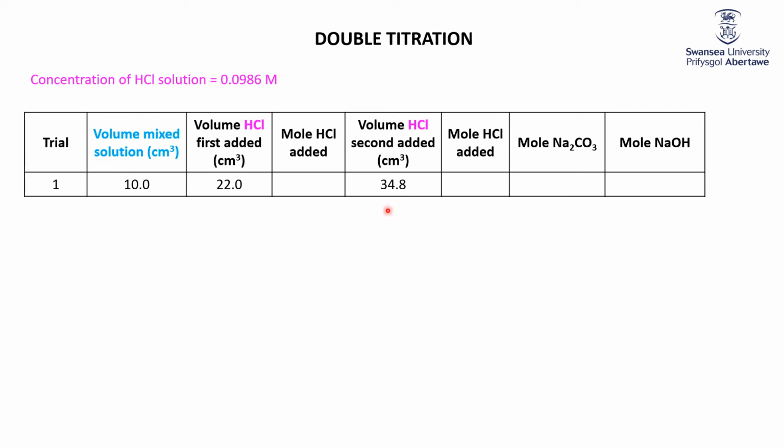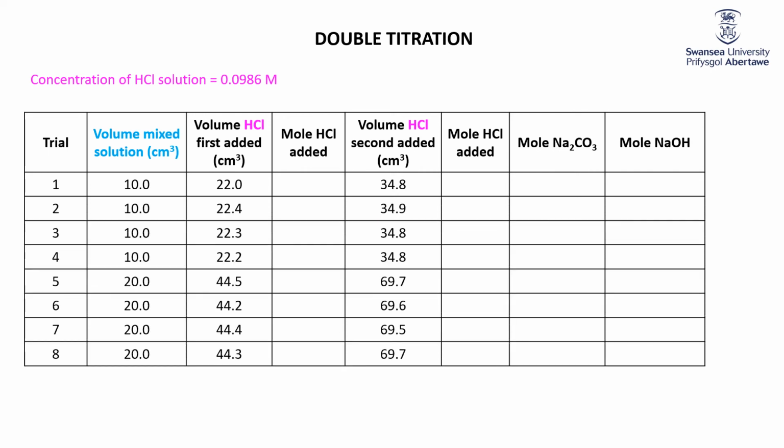Enjoy your calculations. There's a worked calculation that your teachers may or may not let you see. Then, of course, I did lots more data. So 3 more trials in which I took 10 cubic centimeters of the mixed solution, and you can see the volume for the first, the volume for the second, about the same.